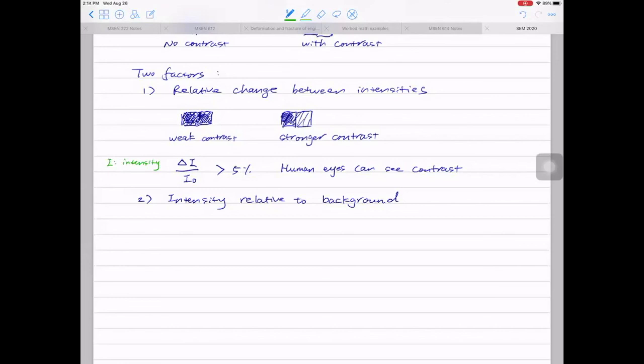I'll give you one example from TEM. If I have a specimen, locally have something blocking the electrons, it will appear to be dark. Anywhere else, they are pretty thin. So the thin areas will have more electrons hitting the detector. And the thick regions, because it's blocking the electrons, will have less electrons hitting the detector. We can also use the number of electrons hitting the detector in the thin area versus the thick area to work out the difference.